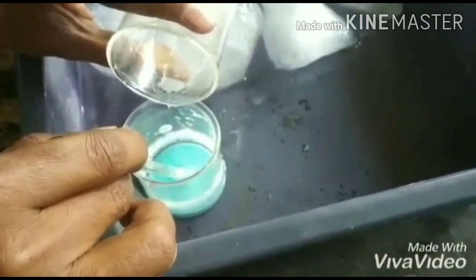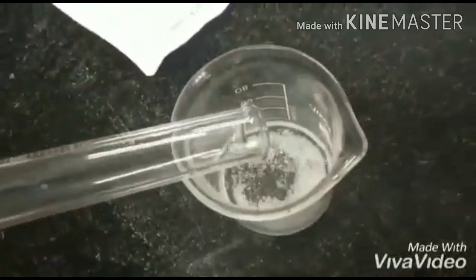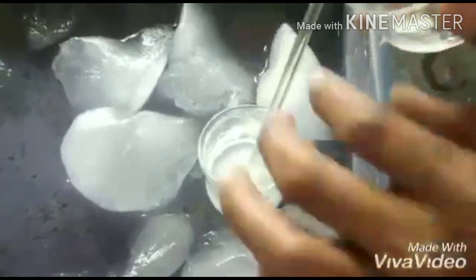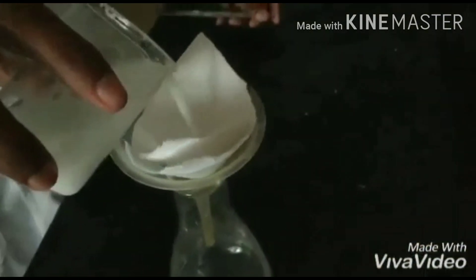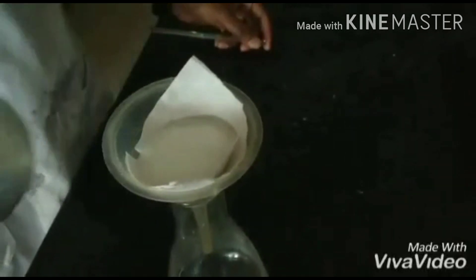Then we add 1 gram of thiourea dissolved in 10 ml of distilled water and stir vigorously to effect complete crystallization. The reaction mixture is allowed to stand for a few minutes and the white crystals are filtered off.